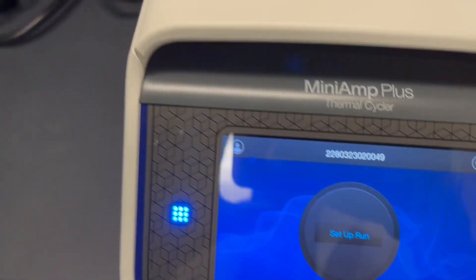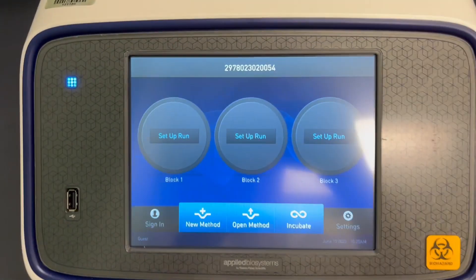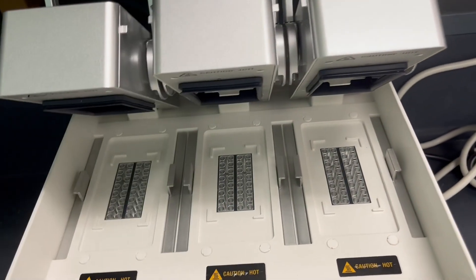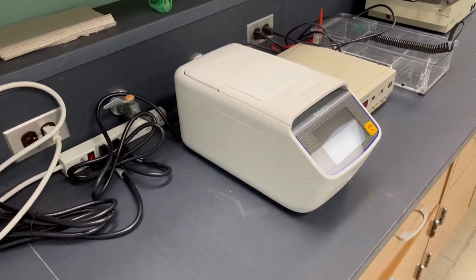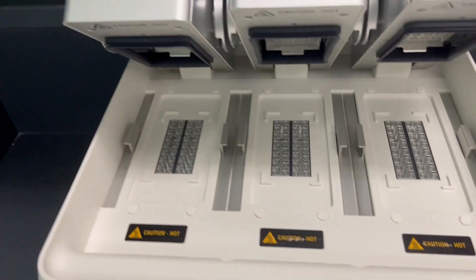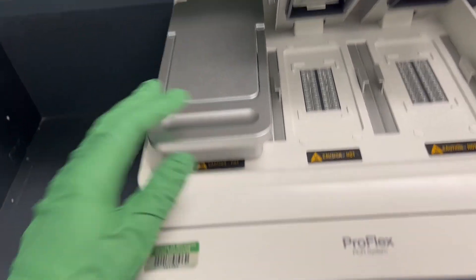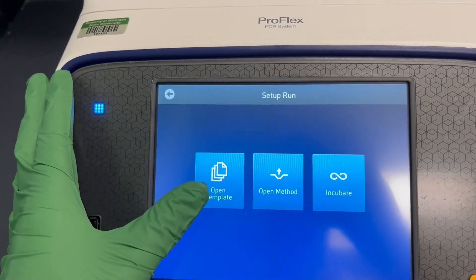Let's cancel out of this for now — I'm going to turn this off and take you over to the ProFlex. What you'll see is that this is very similar, but it has three Setup Run buttons. What's cool about this machine is that each of these blocks can not only run at a separate temperature but can be run completely independently. So whereas on the MiniAmp you change temperatures within one experiment, here you could put a couple of tubes in one block and set up the run just for that specific block.